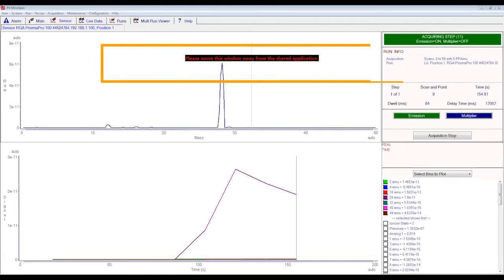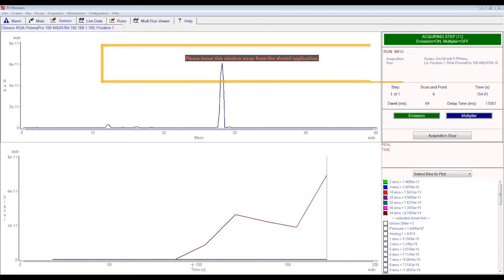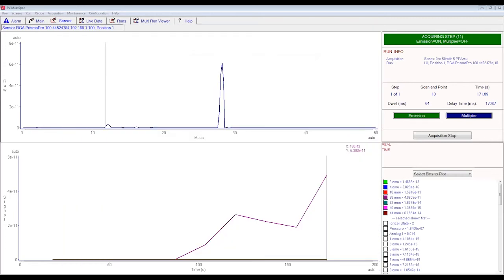Then you measure this background, and then you compare it with the data measured on the sample, and then you can maybe say that you detect a desorption or some kind of chemical process producing the volatile components.